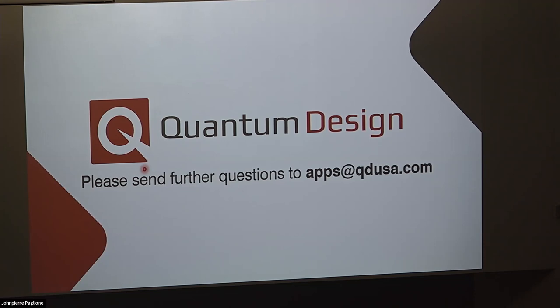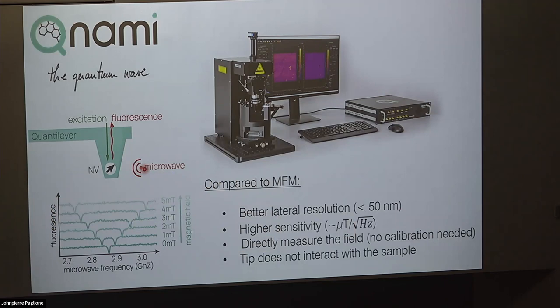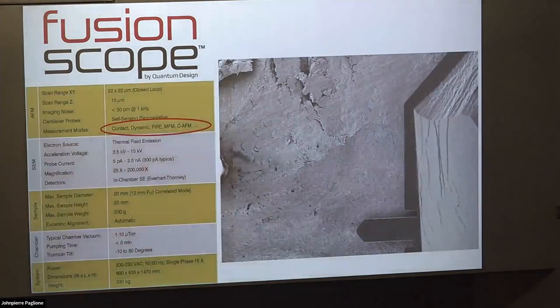What kind of spatial resolution do you get with your SEM? Is it a field emission gun? It's a field emission gun. We're talking tens of nanometers. It's also a pretty good SEM. To be brutally honest, this is not one of these big systems that you're going to be doing the world's best e-beam lithography with, but you've seen some of these systems, like these Phenom systems, these tabletop SEMs are becoming very in vogue now. It's on the order of that or better.